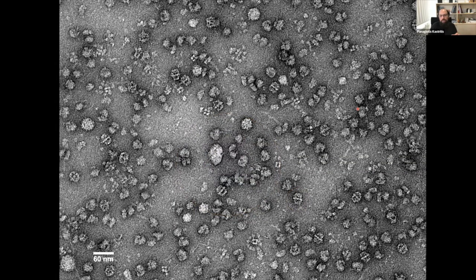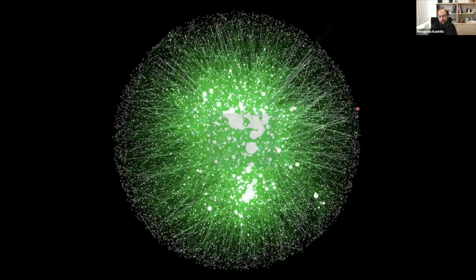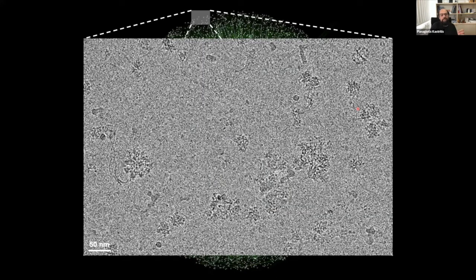And these kind of cell extracts, they fit into the bigger picture of protein-protein interactions of the cell, whereby taking a picture of cell extracts, basically what you see is a snapshot of the protein communities residing within it.